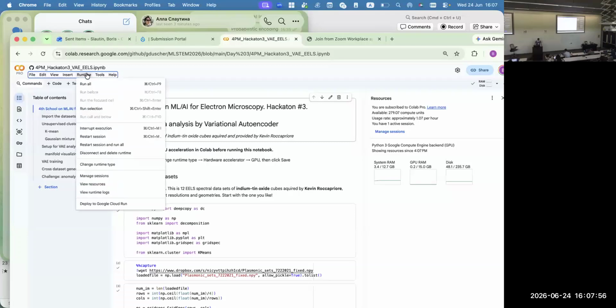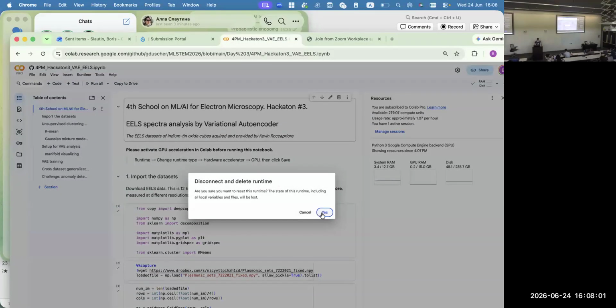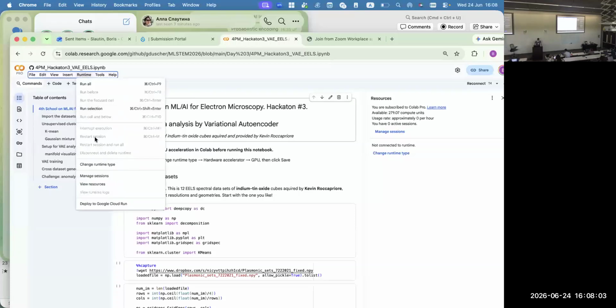Okay, let me just do it from the beginning. We'll disconnect to delete this runtime. Okay, and go to the runtime. Yeah, just already.